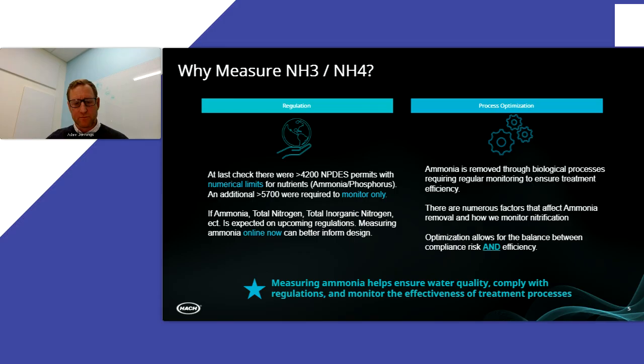And so, we typically measure our parameters that we are required to in the lab, and those are taken off of composite samples or grab samples, and there's different ways that we're required to monitor those. And there's many treatment plants moving into online measurement. So the traditional permitting for treatment plants, you've got BOD, you've got TSS, some form of bacteria, that sort of thing.